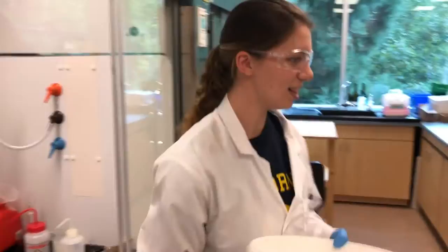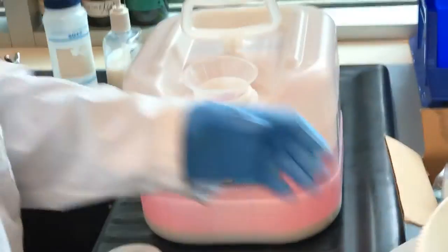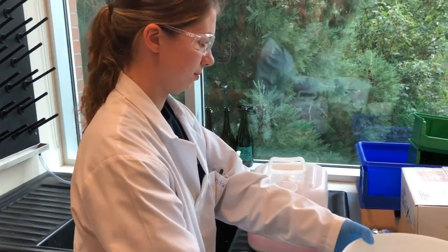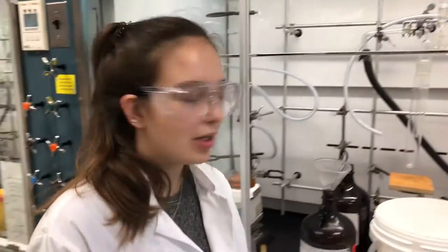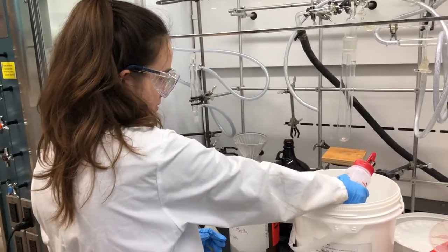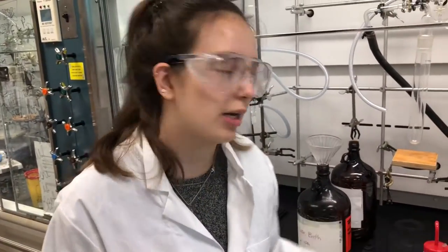And then we just put that water in the aqueous base waste. So now we're just going to clean the sides of the container with some acetone. This we will dispose of as non-halogenated waste.